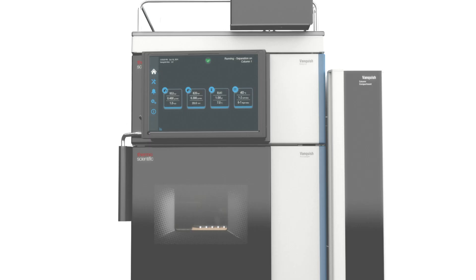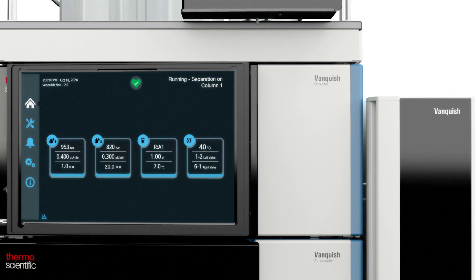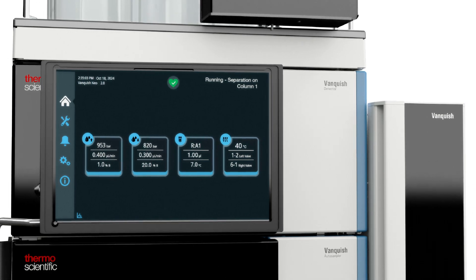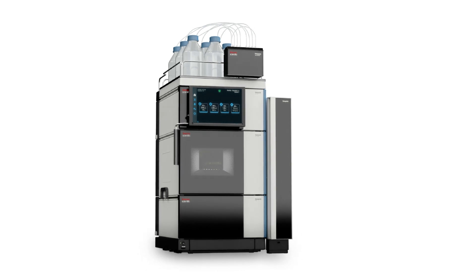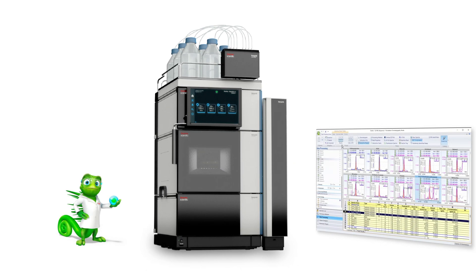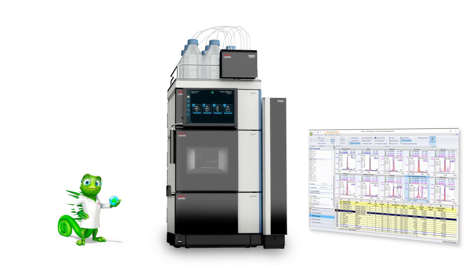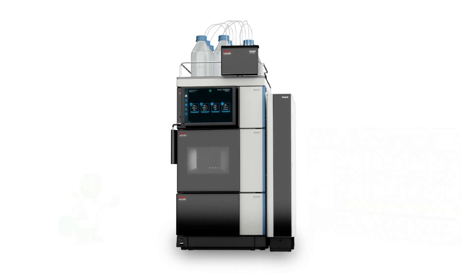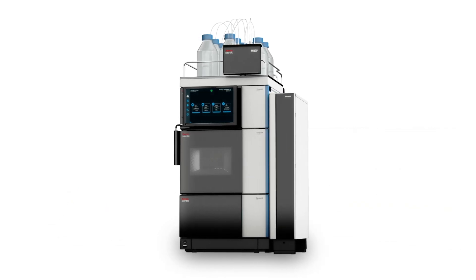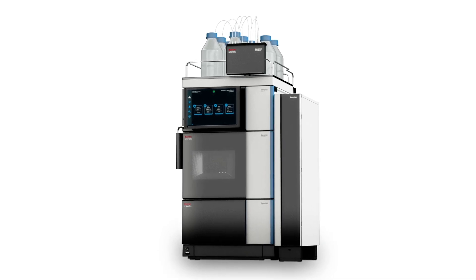The Vanquish LC platform — a straightforward solution for comprehensive detection. From charged aerosol detection to UV-Vis and mass spectrometry, this multi-detector setup is a toolbox every analytical lab needs. With a simple design that's easy to set up and run with Thermo Scientific Chromelion chromatography data system, you'll have confidence in your data. Trusted results, safer products. The Vanquish CAD-P series from Thermo Fisher Scientific. Visit thermofisher.com/cad-p-series to learn more about the benefits of charged aerosol detection.